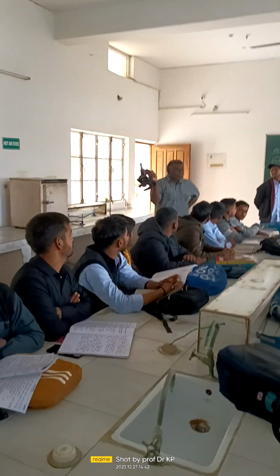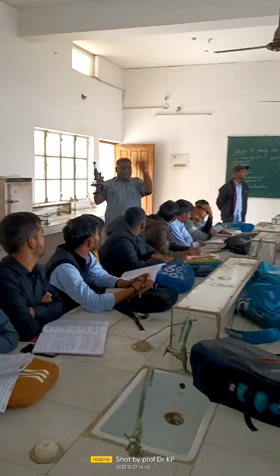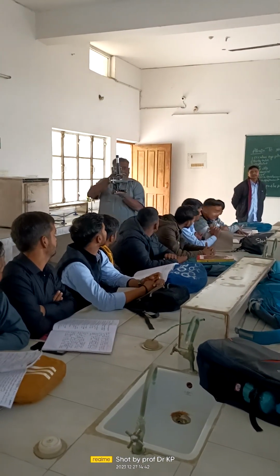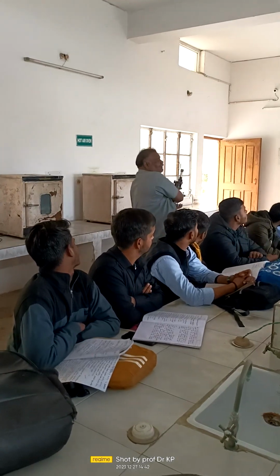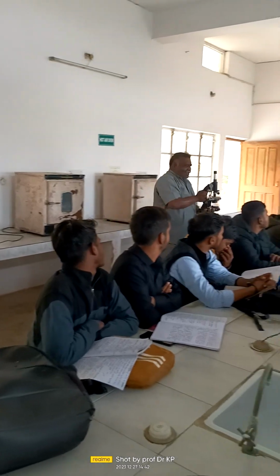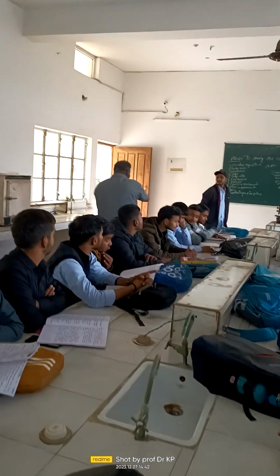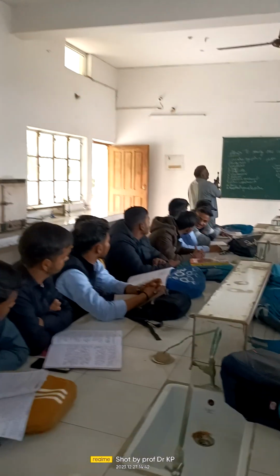Nobody should hold the microscope in this way. One hand, either left or right, under the base, and the other hand should be holding the shaft. So that you can conveniently handle and carry the microscope. Clear?